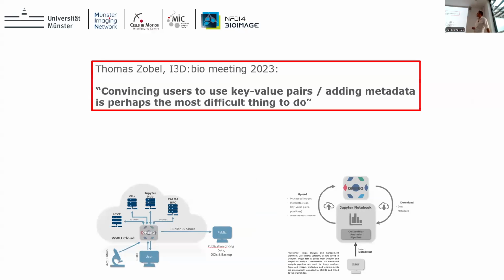We need some information for this, for Omero. And this was a sentence for me from one PowerPoint, from 2023, at an IDR meeting, I3D:bio meeting, that I guess convincing users to add key value pairs or metadata to their data is maybe the most difficult task we have to do.